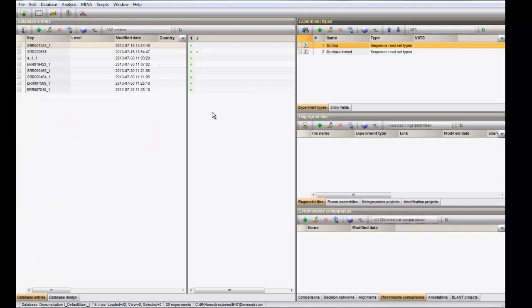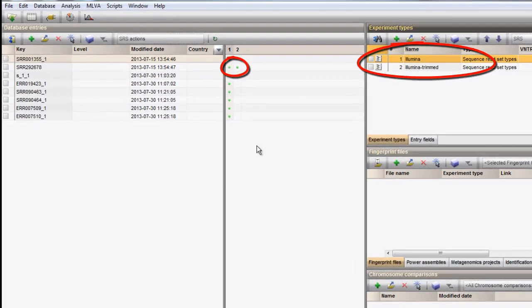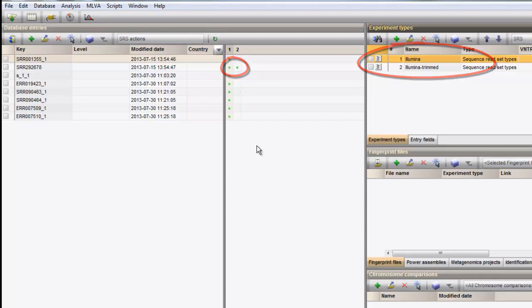Now, we have imported raw sequence reads and the preprocessed sequence reads in two different experiments in our database. Note that, if you want to work on the preprocessed data, you can overwrite the original reads with the preprocessed dataset. This way, the raw reads will not be accessible anymore for later reference.